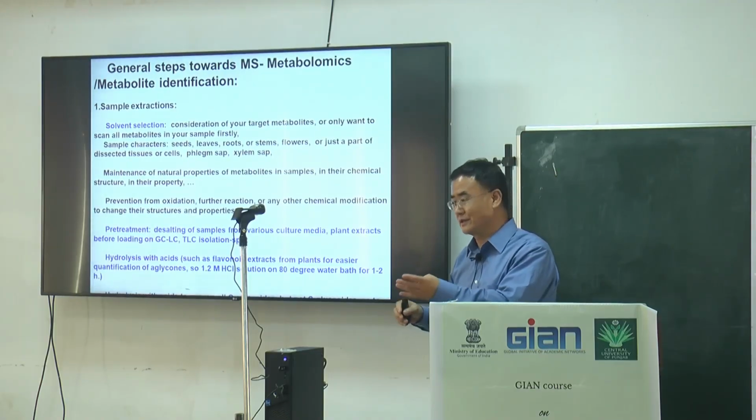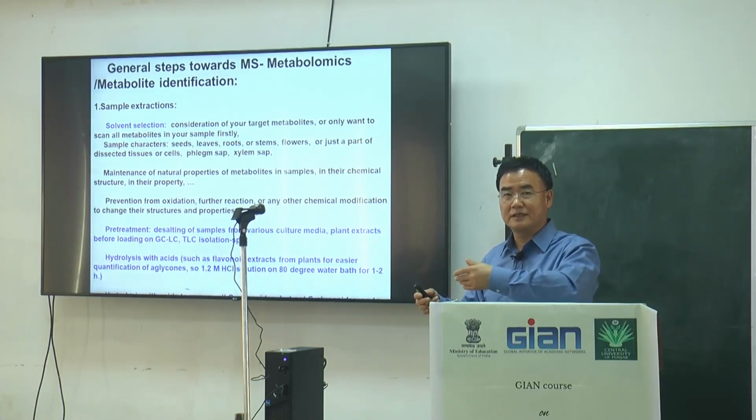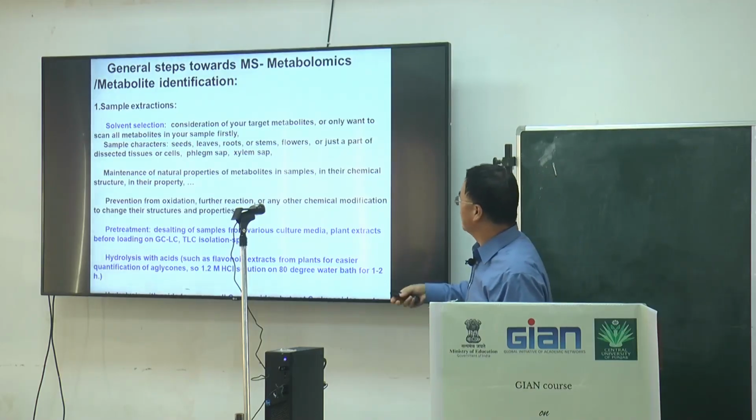So if you consider the root, you probably add more methanol, use 90% methanol. Yeah, adapt a little bit to make your extraction method suit your sample.